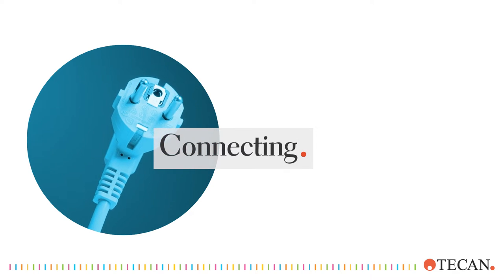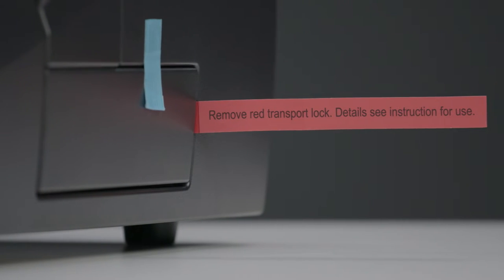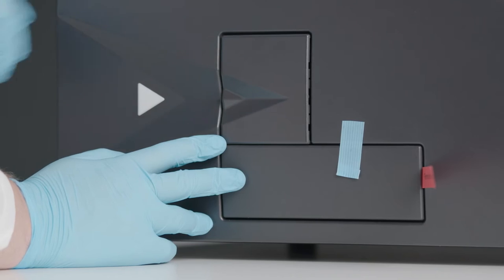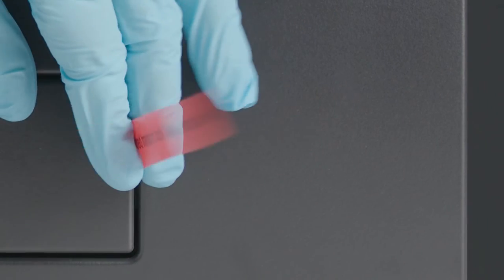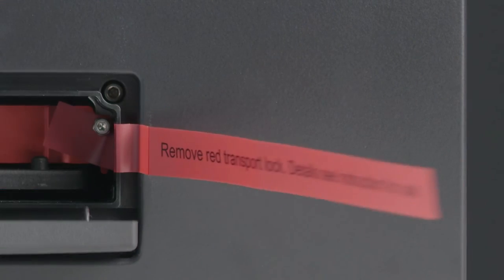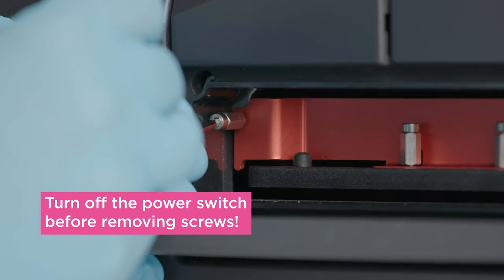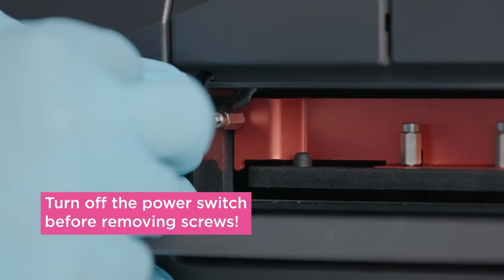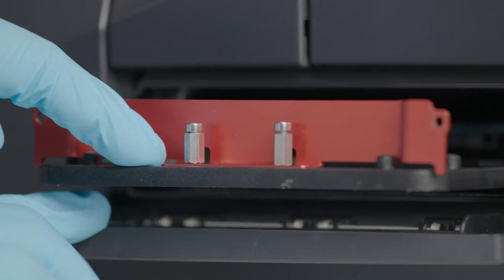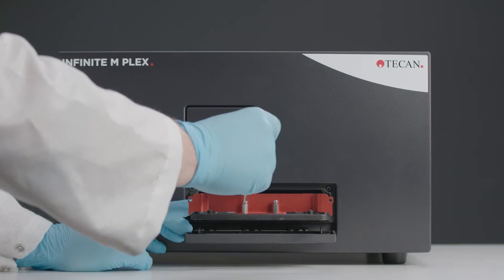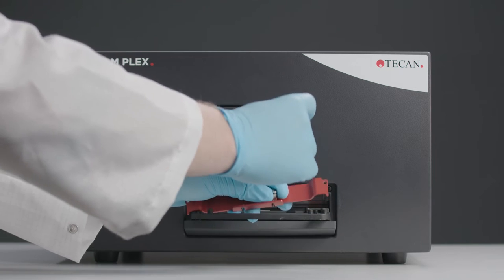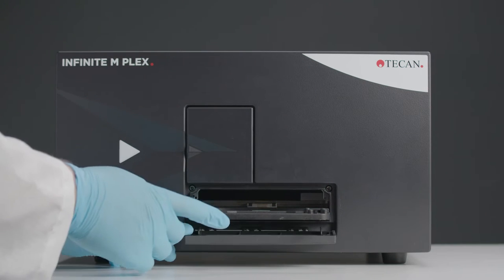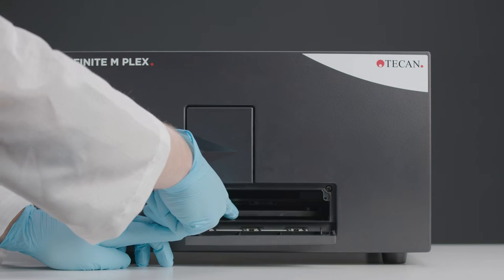Start by removing the transport locks with the allen key provided. Remove the blue tape from the instrument. Open the plate carrier door by pulling on the red tag and carefully remove the screws that secure the lock to the instrument housing. Pull out the plate carrier and then remove the screws that secure the lock to the plate transport. Save the transport locks in case you need them again to transport your instrument.